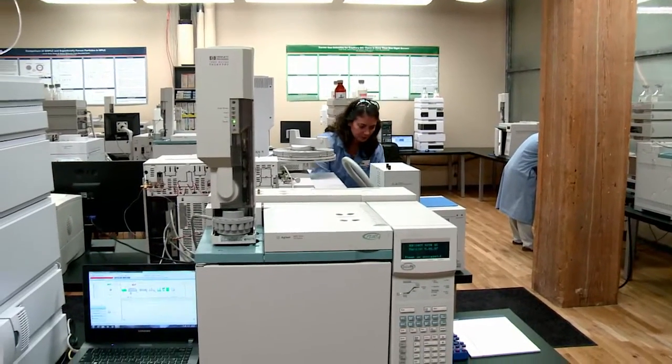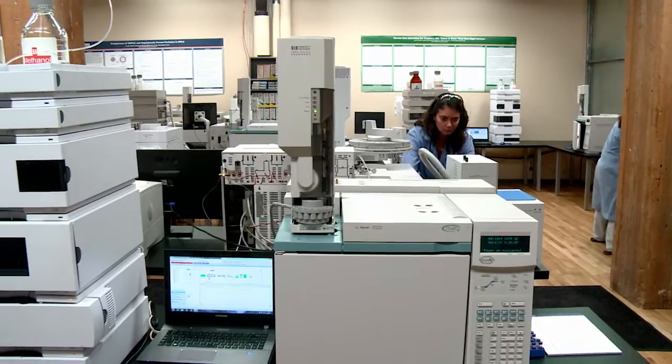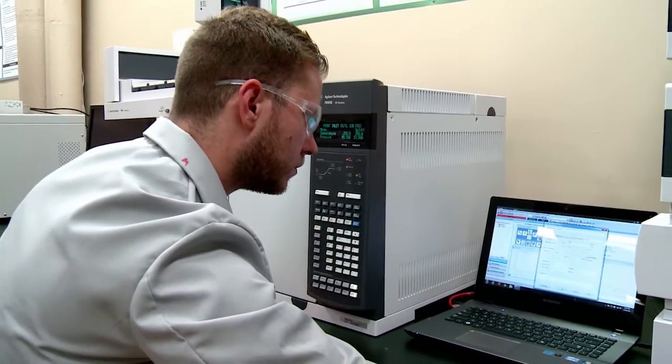And if you don't go in that far, then it'll sputter a little bit and it won't go as fast as it should. And so imagine I'm going to lose performance of my brand new sports car if I don't insert the key properly. That sounds crazy, but that's exactly what we do to the user in the GC world. We give them this beautiful state-of-the-art instrument, we hand them a column, and we say, go figure out how to install it. So I see column installation as something critical in the proper use of the GC. Without proper column installation, we get terrible results. So this is not a trivial thing, this is actually a pretty big point.